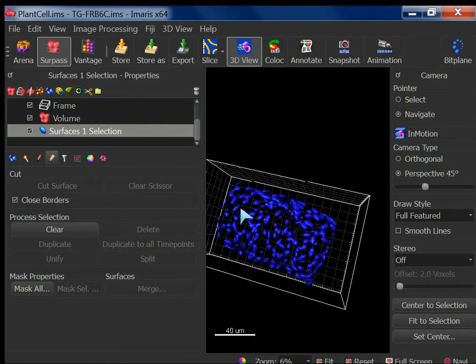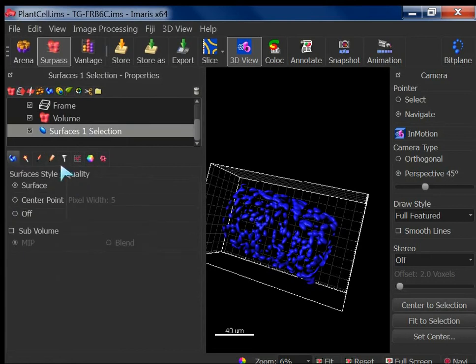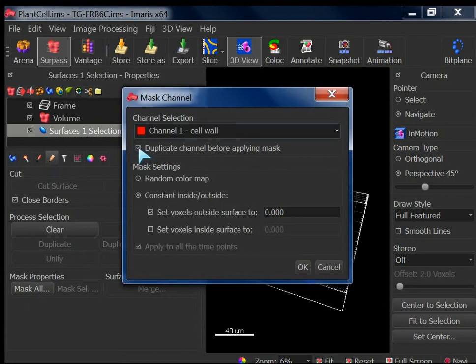Okay, done. So for this case, you will choose mask selected. Sorry, what was that? For the DAPI scenario that you told us, you would use mask selected? I would use mask selected, yes. But if you're asking about this option, the mask one, here. Now it is my choice, if I want to retain my original DAPI or I want to override. So it's a user choice.